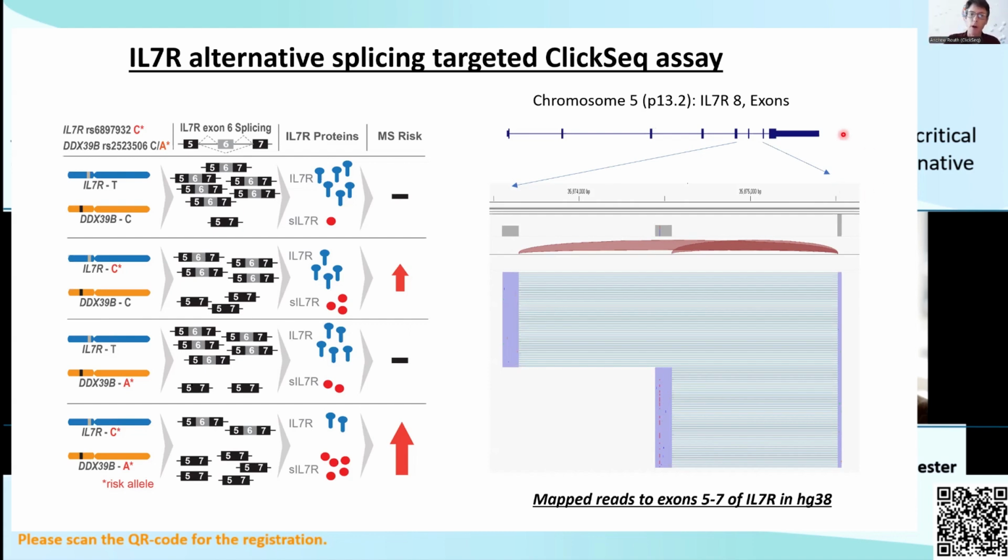We just have one primer that targets exon 5. And in this assay, we could very directly and very simply measure splice variance. So we could measure the ratio of how many times we saw exon 6 skipping or exon 6 inclusion. And so this is a pretty simple scenario, pretty straightforwardly spliced gene where there's only one intron exclusion.